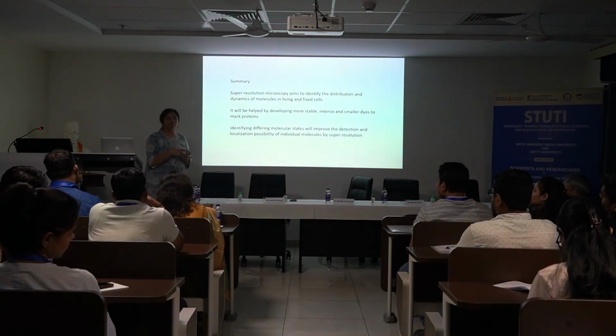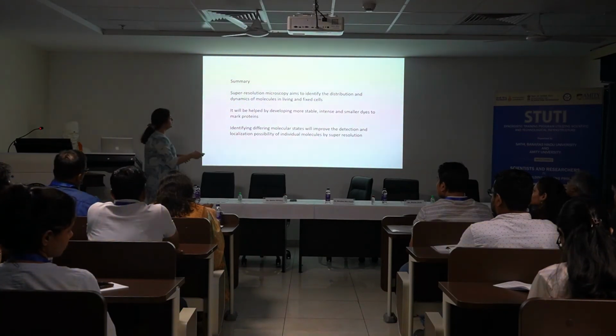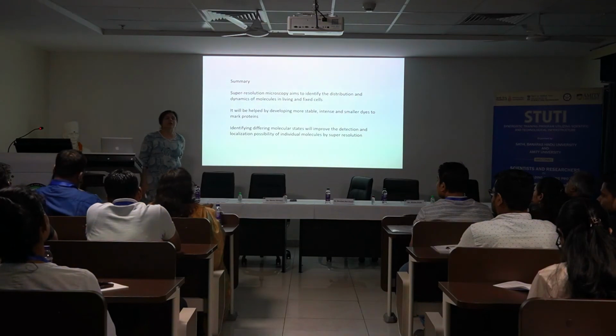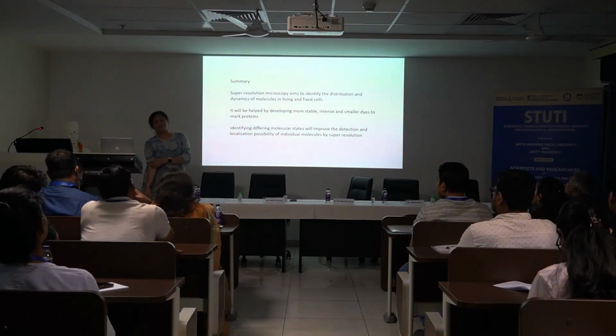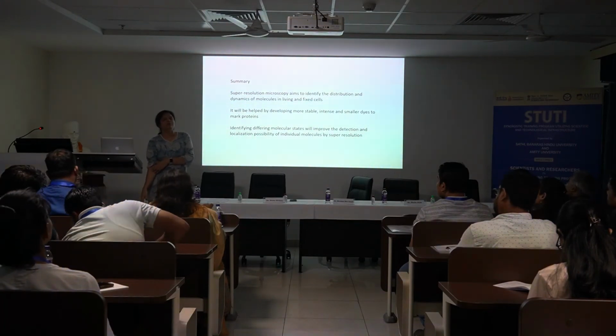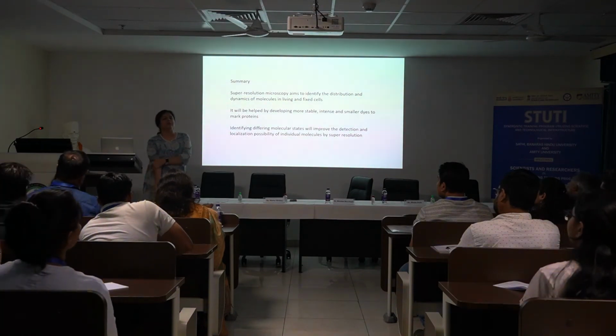So yes, it is true that there is a depletion of the signal, and at the end of it, it does depend upon how intense the light emission from each of those states is. But definitely try out live systems. There would be some system which will work. If you look at the literature, there are examples of places where it has been used.